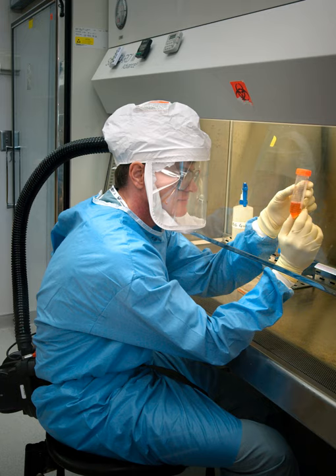Topic: Ultraviolet lamps. The CDC does not recommend the installation of UV lamps in BSCs. The American Biological Safety Association supports this position, citing the safety risk to personnel, shallow penetration, reduced effectiveness in high relative humidity, and the frequent need to clean and replace the bulb. UV lamps should not be used as a primary source of surface decontamination within a BSC.